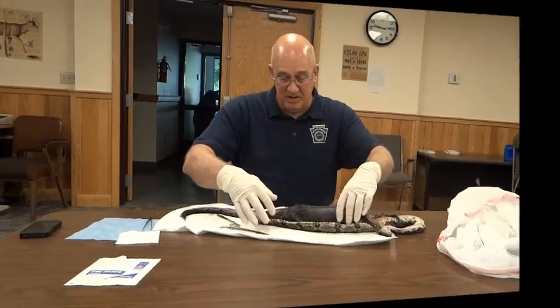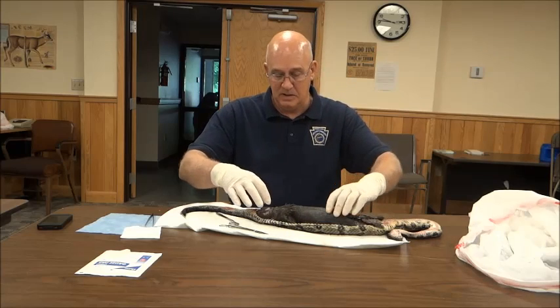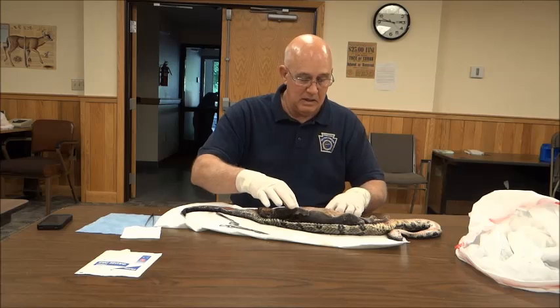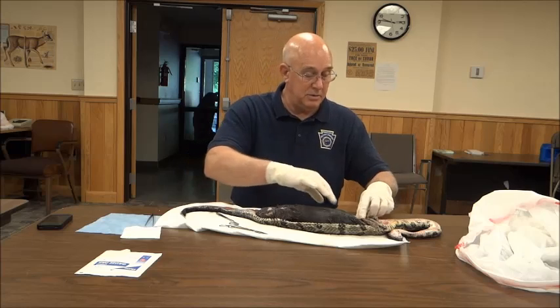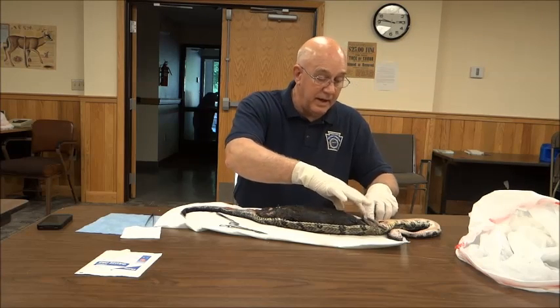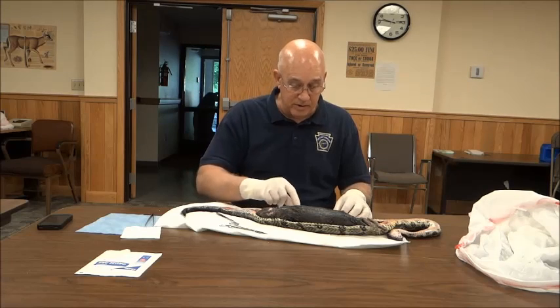We have a 74-gram gray squirrel. It's just too big of a prey item, because there's blood — I think it ruptured the digestive system, whether it was a claw or something.